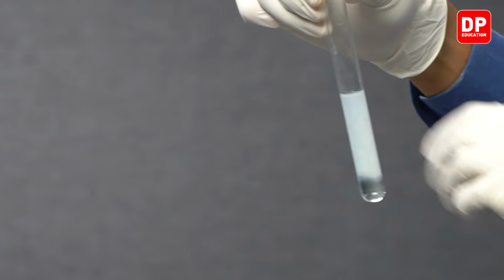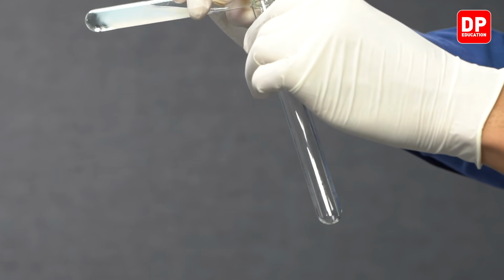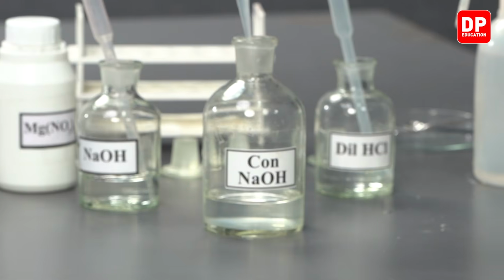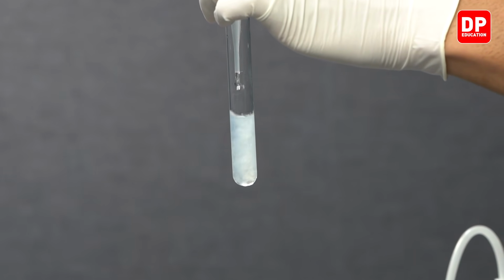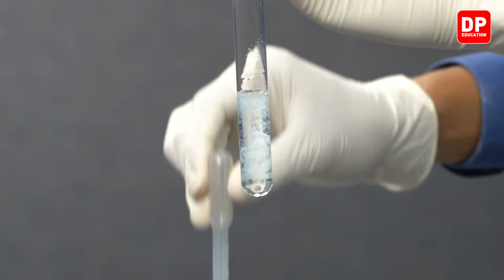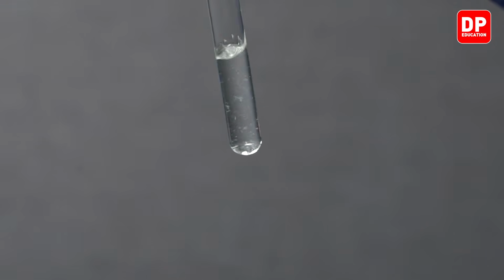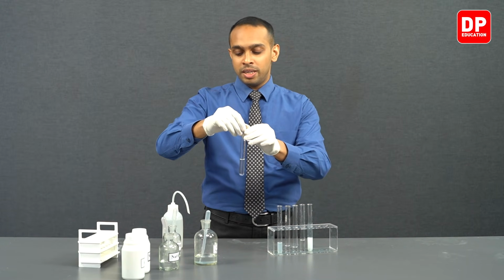However, if you take a small sample of this aluminium hydroxide white color precipitate, and add concentrated sodium hydroxide, we observed how it dissolved in concentrated sodium hydroxide, indicating that aluminium hydroxide was in fact an amphoteric hydroxide. So what we have formed here is sodium aluminate.